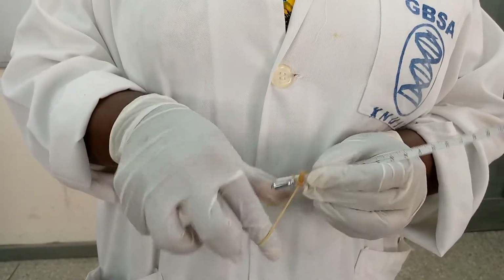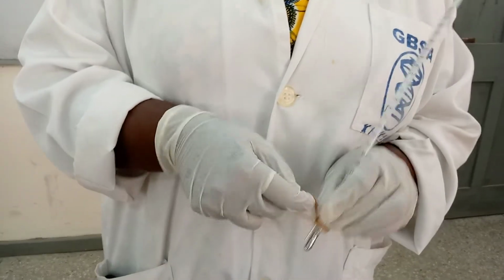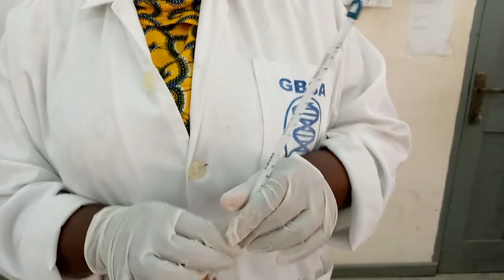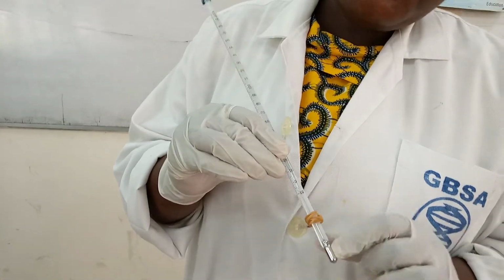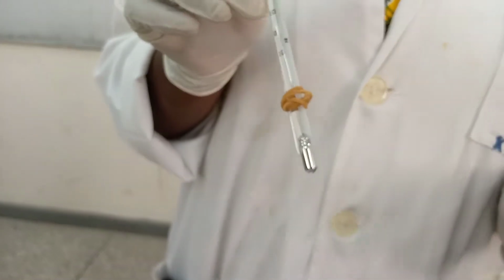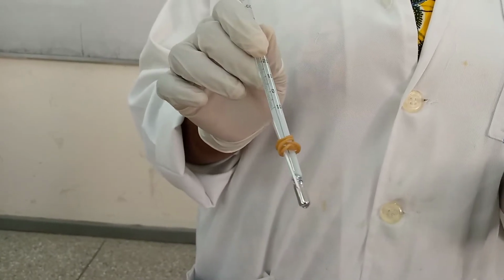Okay, it's a bit loose, so let me tie it another. Alright, so this is how we do it. The capillary tube is here, attached to the bulb. This is how we attach the tube with a rubber band.